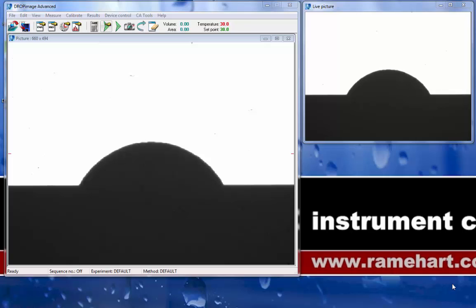Welcome, and in today's video tutorial, we will be taking a look at operating in two window mode versus operating in one window mode.